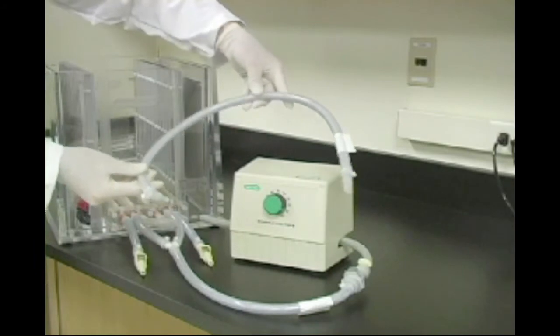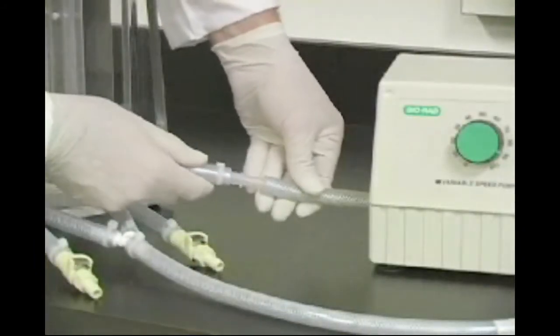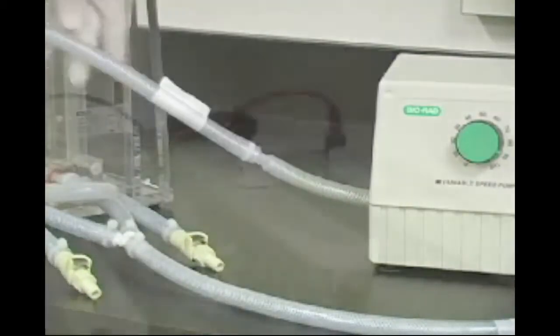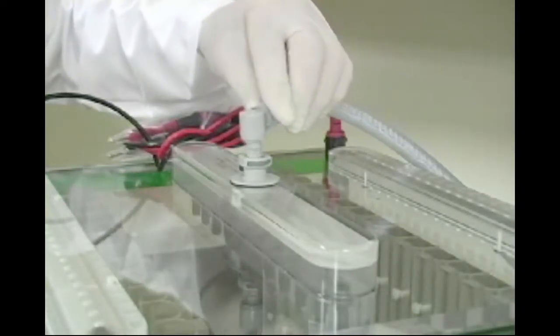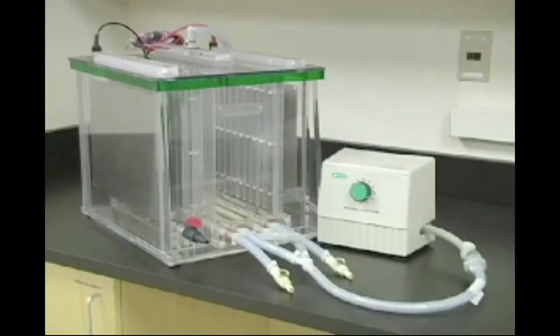Take the buffer exhaust tube and connect it to the tubing on the other side of the pump. Insert the quick connect fitting into the manifold located on the lid of the DodecaCell. The buffer recirculation pathway is now complete.